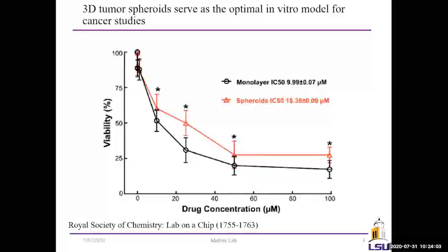3D tumor spheroids is what we used to study in this experiment, and they serve as the best model for studying this because they create a very real environment that mimics what real tumors in the body face. A spheroid is an aggregate of cells that we grew on a hydrogel scaffold. And these are better for studying cancer drugs because they mimic real in-body conditions and how cancer drugs would really fight actual cells in the body. Other approaches to studying this involve 2D monolayers of cells that are often grown in petri dishes that do not exhibit real features of cancer tumors.